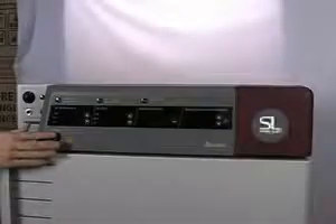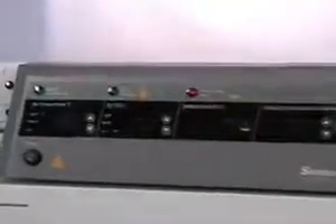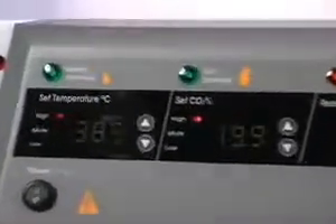With the end user in mind, the incubator's door thermostat comes preset. The result is a more uniformly controlled temperature and less required calibration. These themes of technology-enhanced accuracy, trouble-free, and end-user-oriented operation are resonated throughout this microprocessor-controlled series.